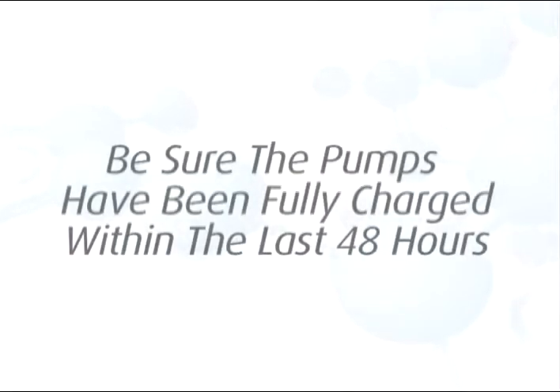To calibrate the pumps, they must be charged. If the pumps have not been fully charged within the past 48 hours, you must recharge the pumps prior to sampling.